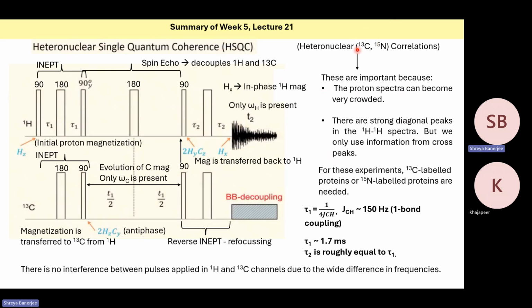Now, we saw in one of the earlier classes that the population of 13C or 15N is low. The more prevalent nuclei are 12C or 14N, which are not NMR active. So in order to observe HSQC, normally you will need to label the proteins with 13C or 15N. Basically, you will have to grow the E. coli or other system in a medium containing 13C or 15N, so that any proteins they produce are already labeled with nuclei that are NMR active.